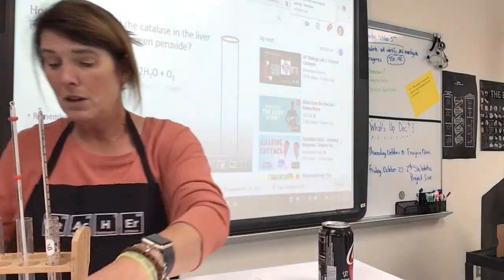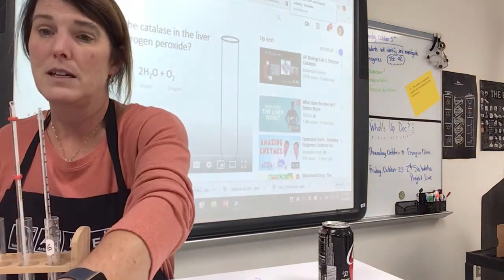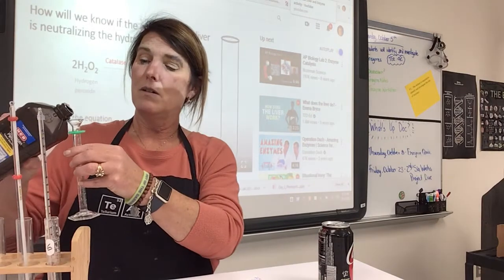Okay, we have one more to go. So I stick my thermometer in this one. This one is the one that was kept overnight in acetic acid, which is vinegar.